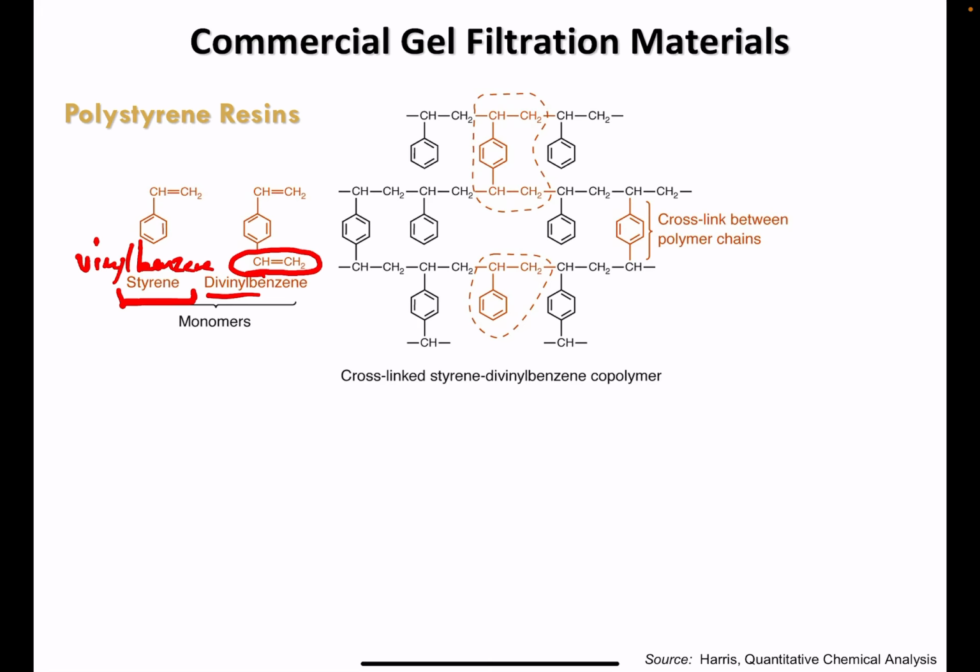Divinyl benzene acts as the crosslinker, and it will covalently stitch main chains together via that extra appendage for polymerization. So anytime there's a covalent link bridged by a phenyl group, we can point to a divinyl benzene monomer that's been used to establish that crosslink. These covalent bonds stabilize the ultimate structure of the bead, preventing full dissolution of the bead material in order to retain that in the pipe, in the column, and not elute or shed polymer material outside the exit of the chromatography pipe.